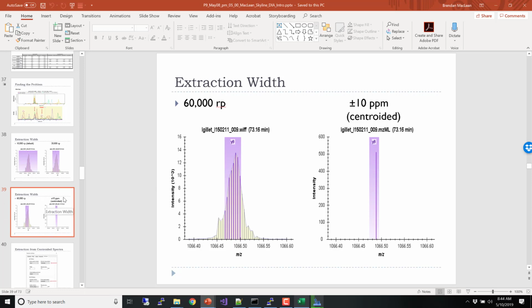So we're extracting. Centroiding. Sometimes the number is different, but most of the instrument vendors are either using an area number or a sum number that's very similar. So the centroid will still represent the total number of ions per second entering the detector.